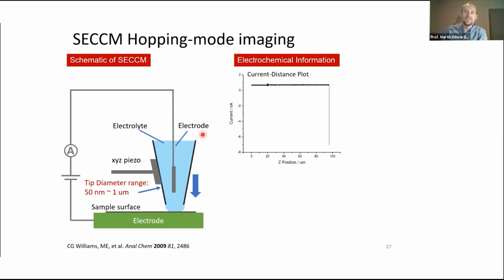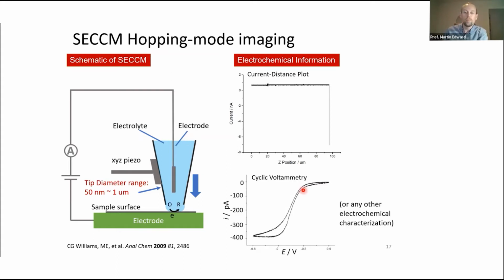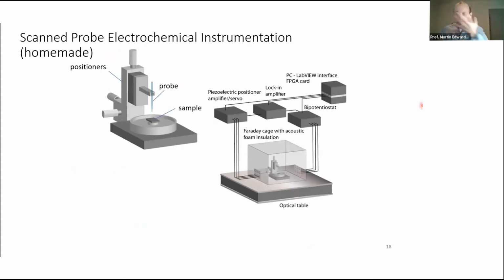If we didn't, that glass is very fragile and it wouldn't end up very well for our probe. It would shatter all over our surface. And once we're there, we perform basically whatever electrochemical characterization we choose. This one happens to be the kind of most common and quite a versatile electrochemical technique, but in principle, we can do whatever technique we choose.